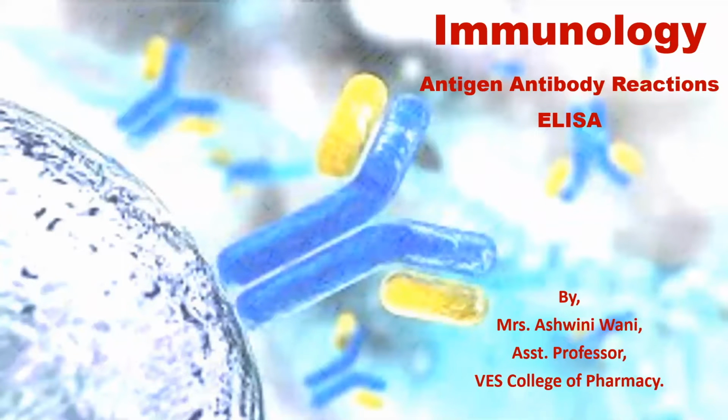Hello students, welcome to the next lecture of antigen antibody reactions. In this lecture, we are going to start with enzyme linked immunosorbent assay, that is ELISA. It is one of the most popularly used antigen antibody reactions in diagnostic immunoassay. So let us look at the basics, the principle and the types of ELISA test.